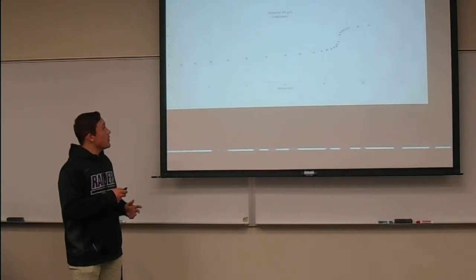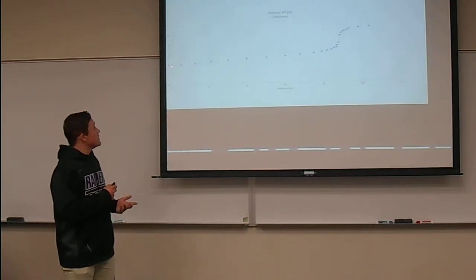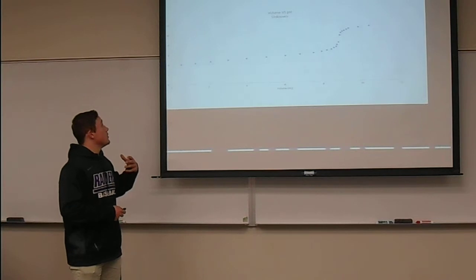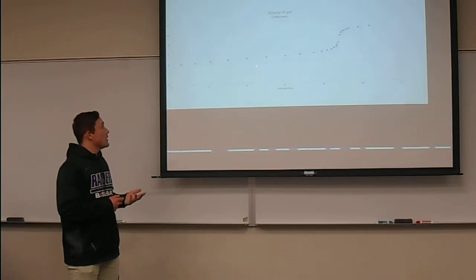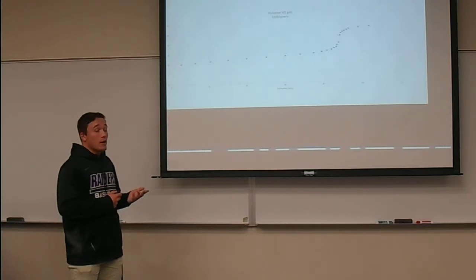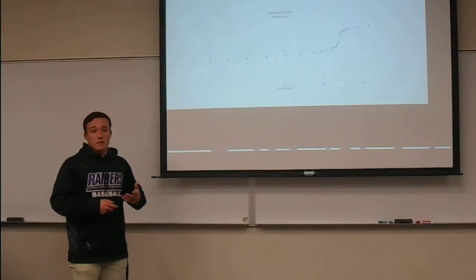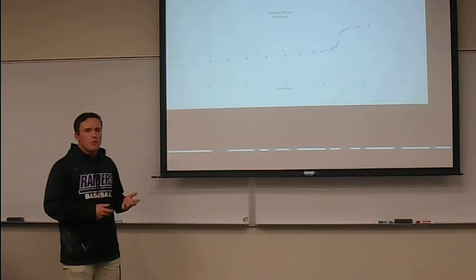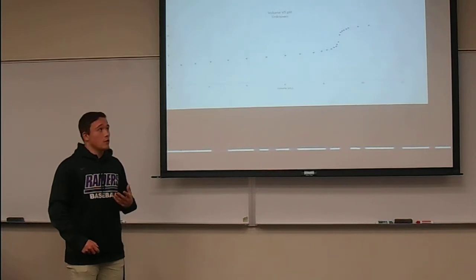So this is for the unknown. We can also tell that this is a weak acid, even if they give it to us as a weak acid, but sometimes you won't know if someone gives you an unknown acid. We can tell because this line goes straight towards around a 4, which means this is most likely a weak acid. For our unknown, the equivalence point is around 8.7.